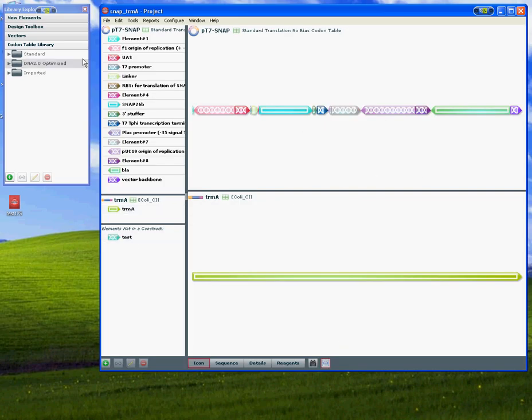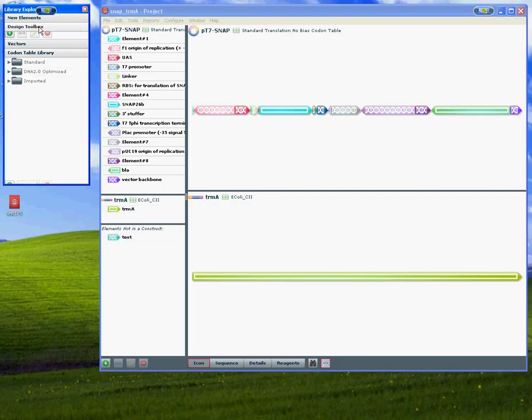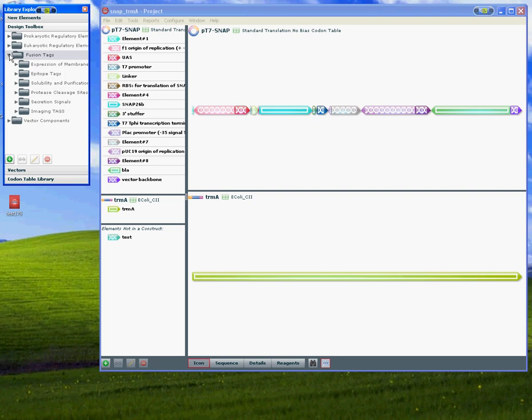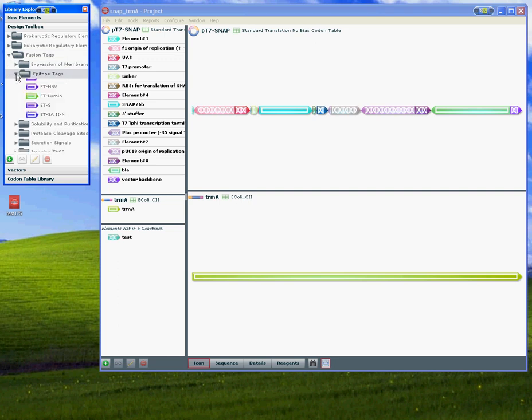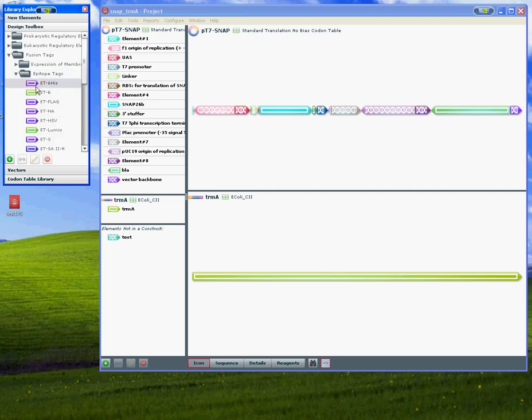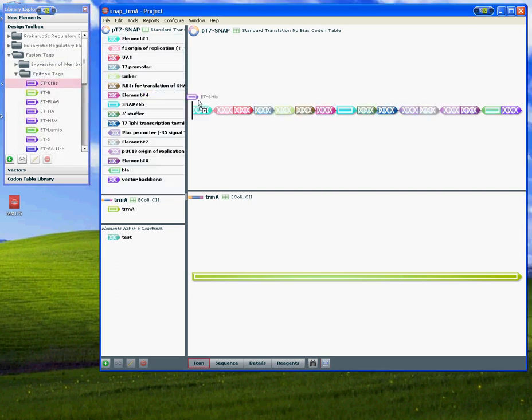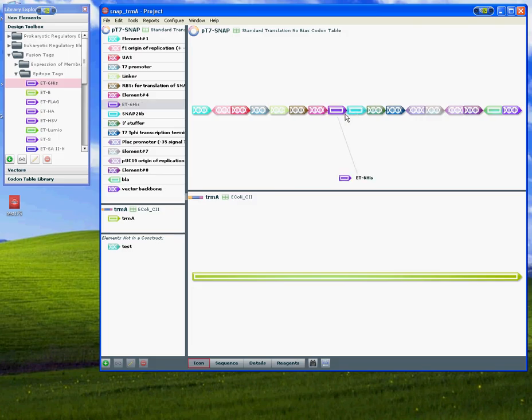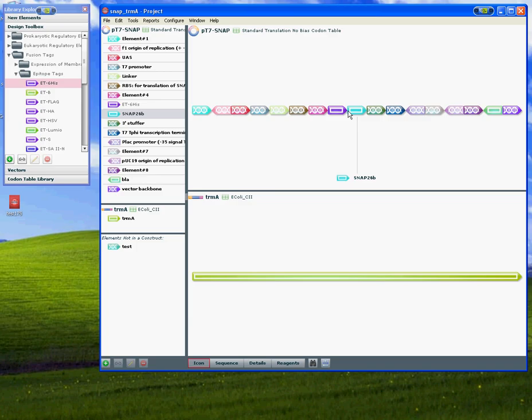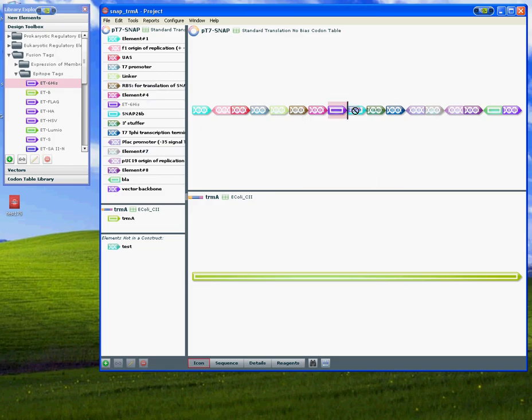You can also take an existing element, like the his tag, and put it next to the pet gene, the snap gene, or drag it around as you please.